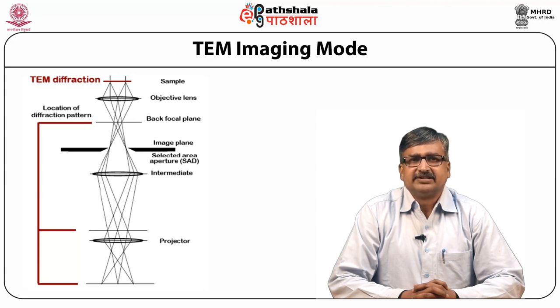These lenses have different workings. Based on that, we will image our sample in a transmission micrograph, and a magnified view can be seen on the projector lenses. One can also see our sample by binocular. At the end, we have a 35 mm film which records the image in this case. Nowadays, we also have a CCD camera where our image can be stored. Now, I want to play a video which will explain things more clearly.